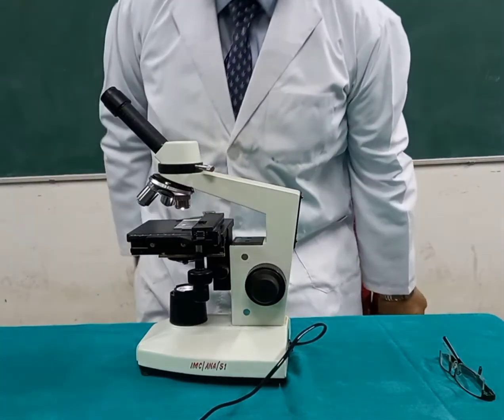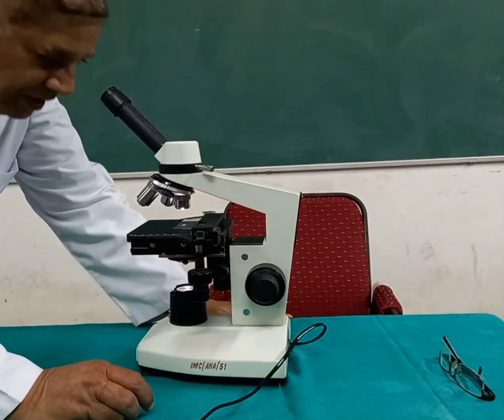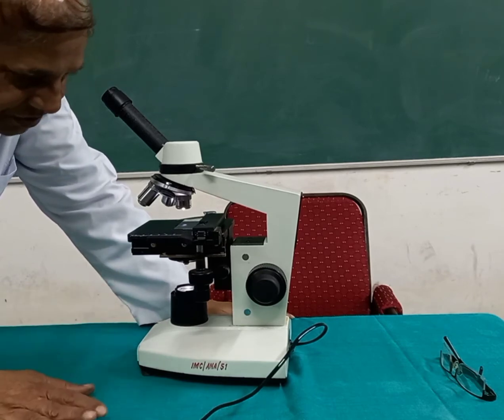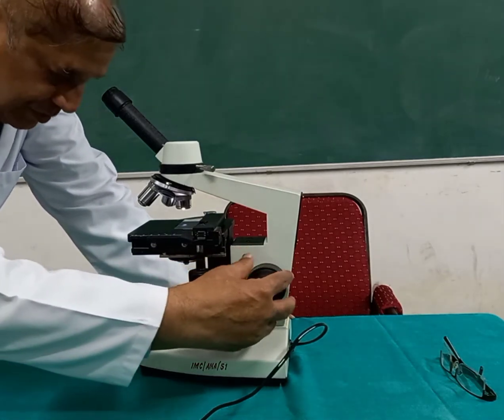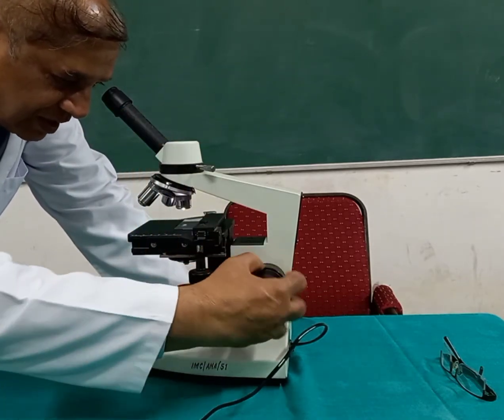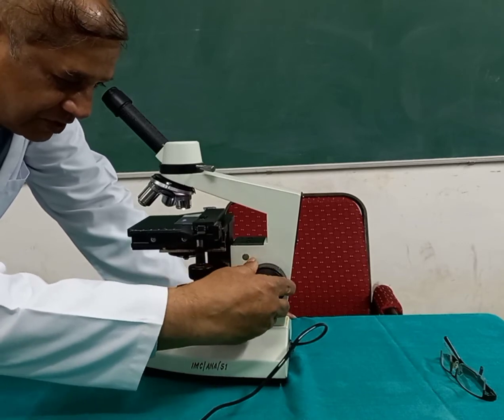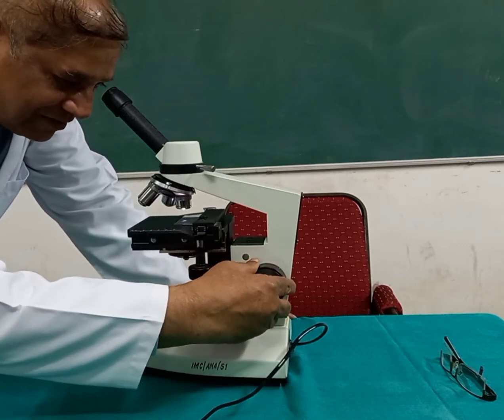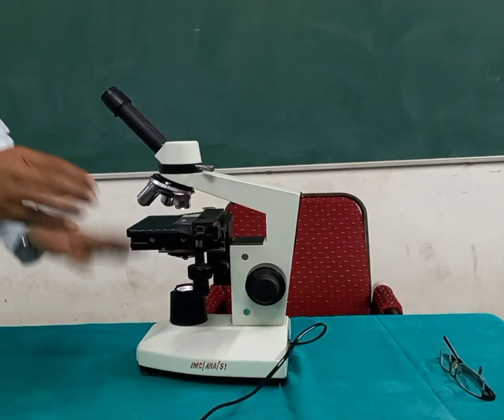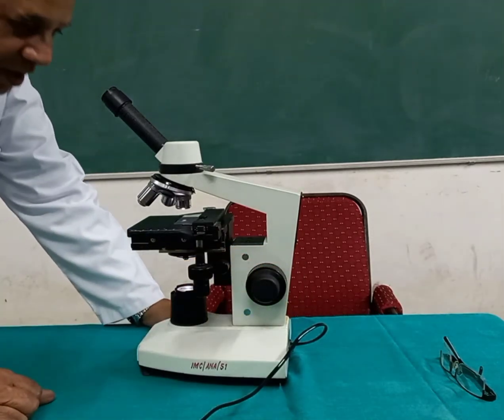So I will just stand up and see through this, and this may not be focusing, because we have not adjusted the coarse and the fine adjustment. So first I will move the coarse adjustment, this bigger knob, which goes up and down. I will rotate it, and then we'll see the image. Now I have started seeing the image by moving the bigger knob, that is called the coarse adjustment.